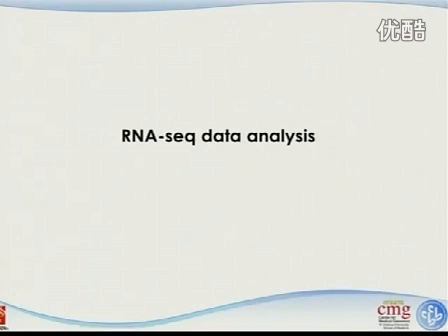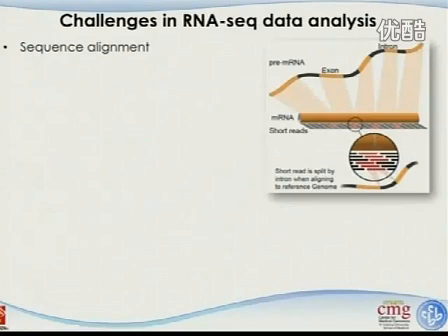So there are a lot of very creative RNA sequencing applications, and I think you really need to use this technology creatively to help your research, not just for routine analysis. Okay? So now I'm going to switch gears a little bit and really talk about the data analysis part.